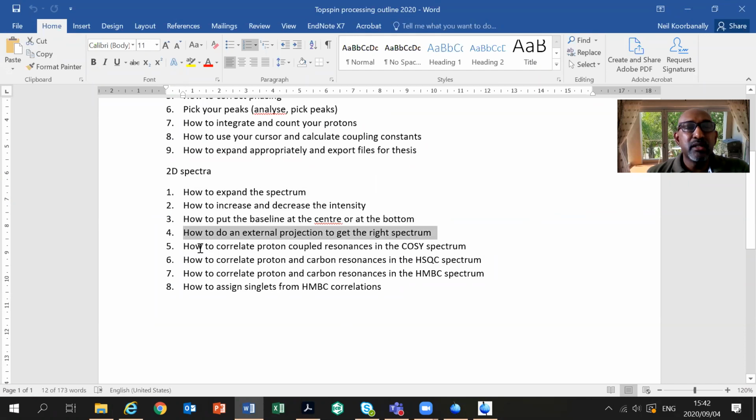I showed you how to do external projections. You saw how to analyze a COSY spectrum. You saw how to analyze an HSQC spectrum. You just recently learned how to analyze an HMBC spectrum, and you learned how to use the HMBC spectrum to assign your singlets. So I think we've covered everything that we needed to cover in these 2 sessions for the NMR workshop of the Chem 751 course.